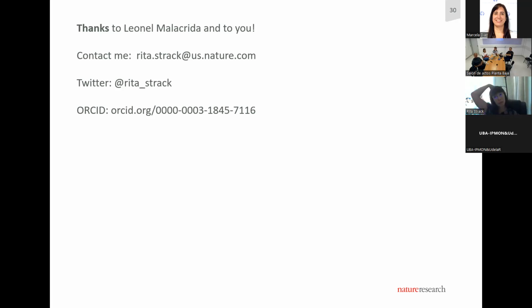We published this. Oh, you're from Enrico's lab, so you know phasers. We published this hyperspectral phasers paper from Scott Fraser's lab. Yeah. And the initial paper just showed 3 color imaging, and I was like, look, this is amazing technology. You're going to have to show me what you can do. And then they ended up coming back to me with 14 color imaging in an intact zebrafish, and I was like, this is what you could do. This is what we wanted to see. So that's the sort of thing we're really pushing our authors on. And that's something that's really important to us.